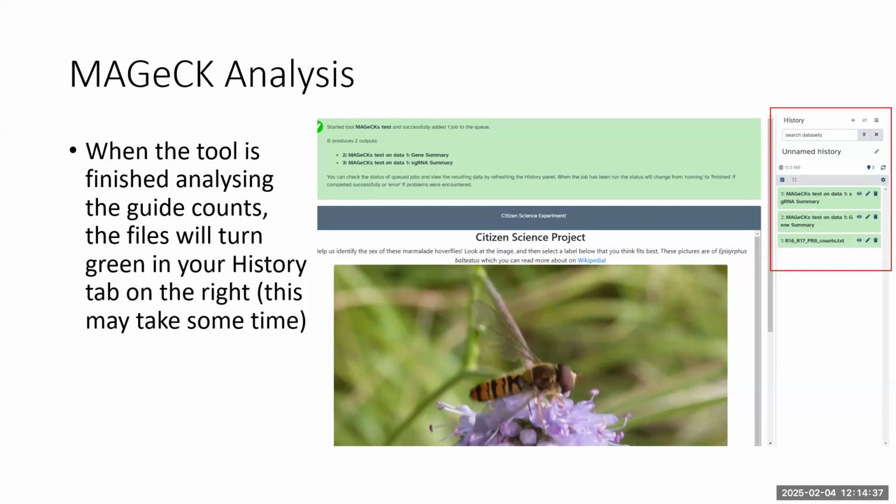So Chicken 6, and what Nick would have done was generate a file that had all the open reading frame sequences on it. So no introns, no exons, none of the 3' UTR, 5' UTR, just the open reading frame. You then want to use some of the tools that are already being designed, often by the Broad Institute. Victor was talking about some of those.